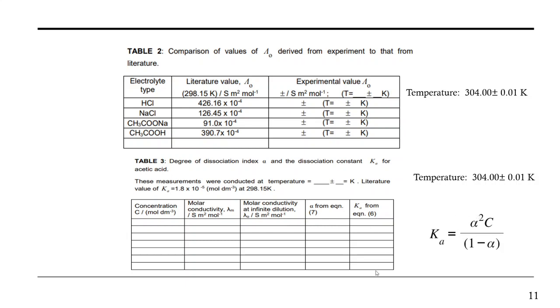Okay, and then you just fill in this. So I do want you to show the calculation, don't just fill in this, but show the calculation as well. And from the plots also do comment on that.